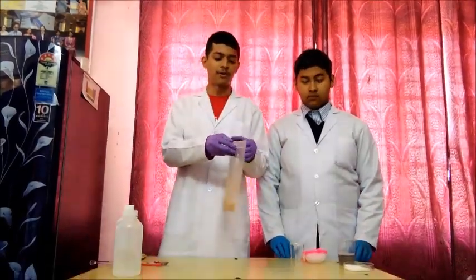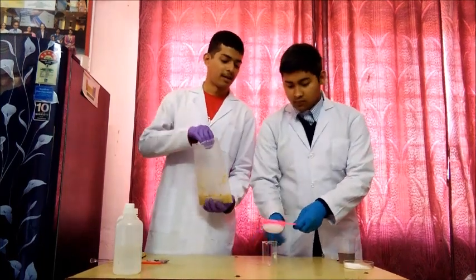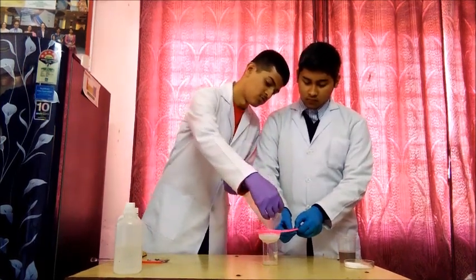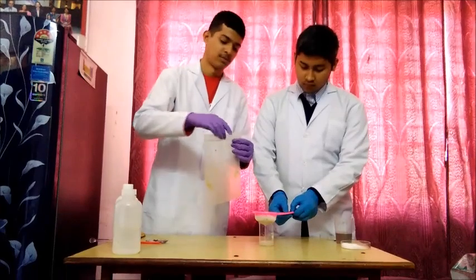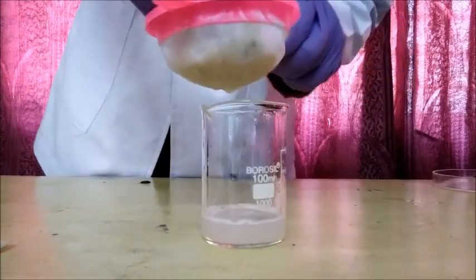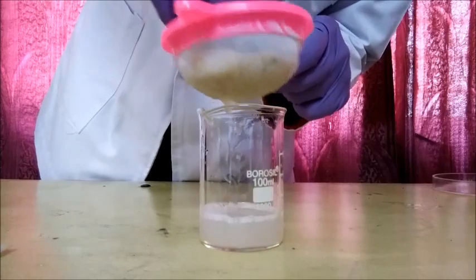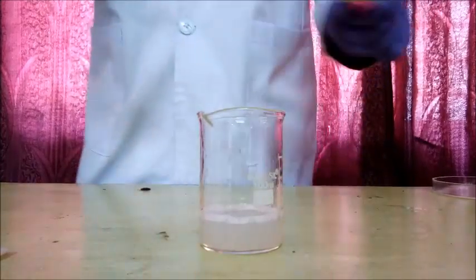The next step is to filter the banana smash. We will do it with the help of the tea net, placing it on a beaker, then pouring the whole banana smash into it. Now we will gently squeeze the banana smash to get a liquid, then place the tea net aside.